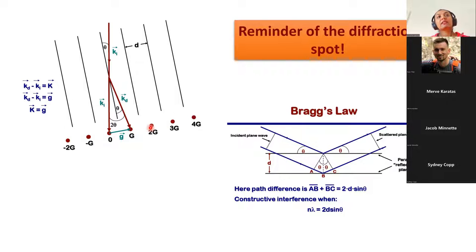Now, in many cases, you will have a sample and a precipitate associated with it, so there are a lot of cases where you will get two diffraction patterns slightly superimposing on each other. This kind of condition could occur from a lot of places, such as where your FIB sample became slightly oxidized. It very easily happens in your reactor pressure vessel steel, which is iron chromium, because despite having chromium, it gets very easily oxidized. So every time you use it in the microscope, you try to get rid of the oxygen layer.